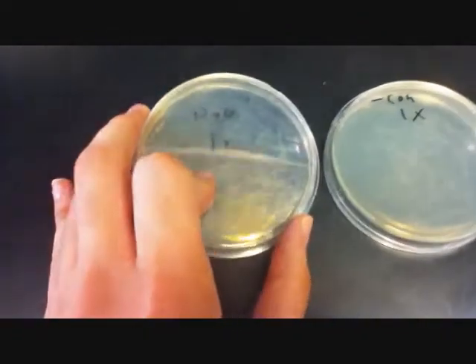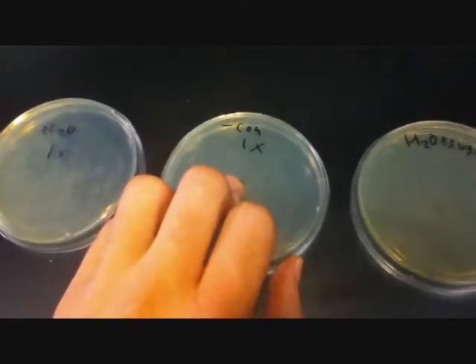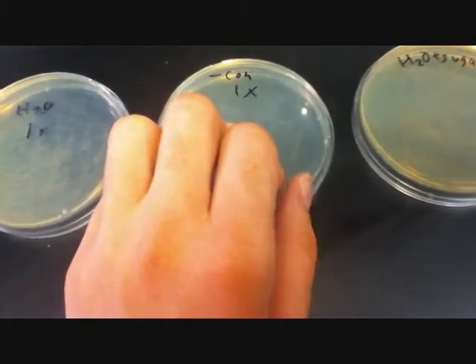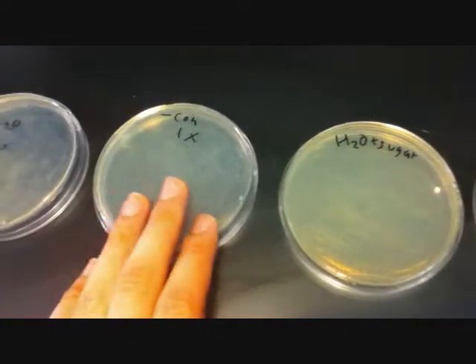First off, we have the H2O — it was the best environment for the bacteria. Then we have the negative control, which was three milliliters of BHI with 400 microliters of Listeria, non-virulent, and it was in the fridge all night before being incubated. So this should have been the starting point of the bacteria.